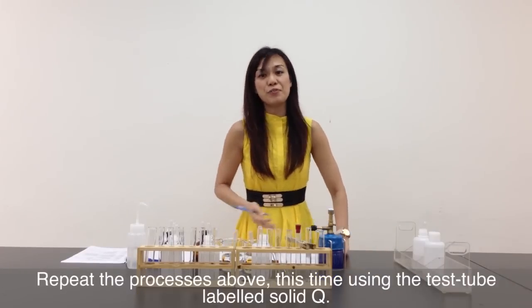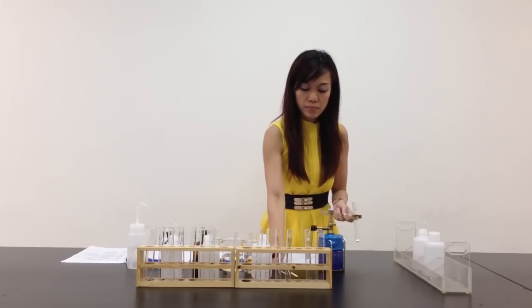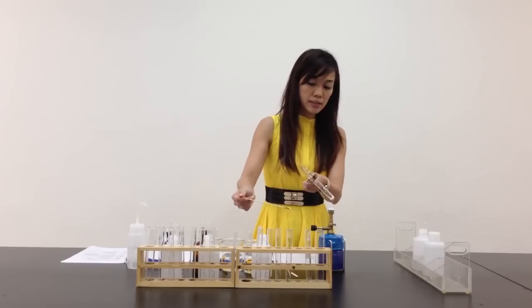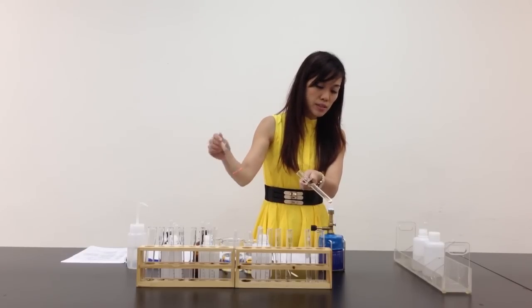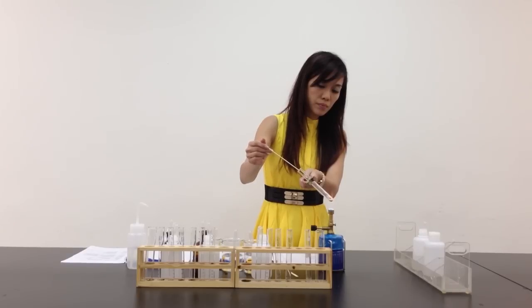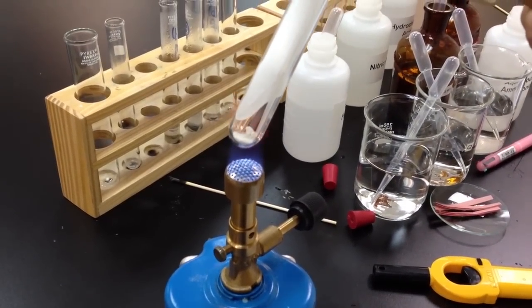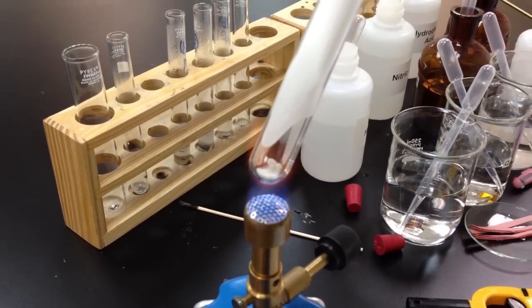I'm supposed to repeat this for solid Q. Let me remove the rubber stopper and prepare my splint. I light the splint first. As I heat Q gently and then strongly, I notice that white fumes are evolving. I place the glowing splint at the neck of the test tube. I can see from here that solid Q melts, but it gives up a gas — so it's going through sublimation.